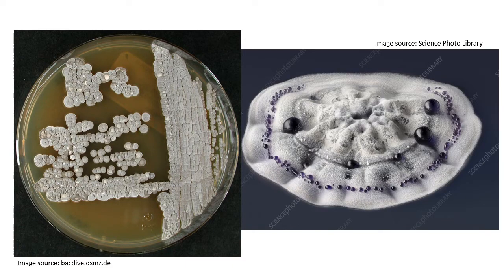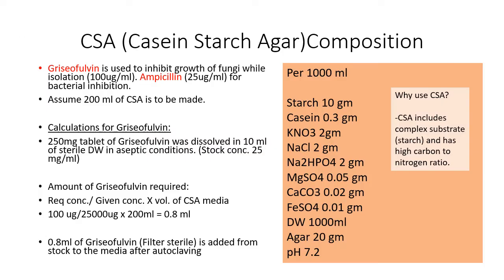So this is how your Actinomycetes plate should look when you are trying to isolate a particular isolate or culture. Okay, so you can see how powdery, dull and dry the colony looks. Okay, and if you focus on a single colony, then you will see it has that cottony appearance, dry and dull, and it is very tightly attached to your agar surface.